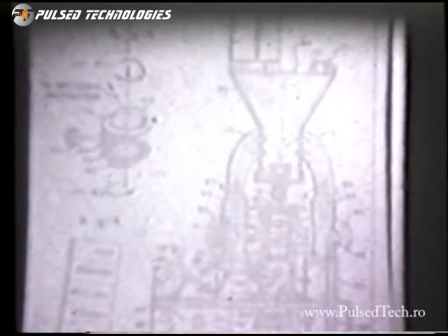The eyepiece shown there can be looked into to see the image, or it can be seen on a ground glass which covers the top of the instrument, which eliminates empty magnification. This means that everything that's projected up can be seen on the view plate.